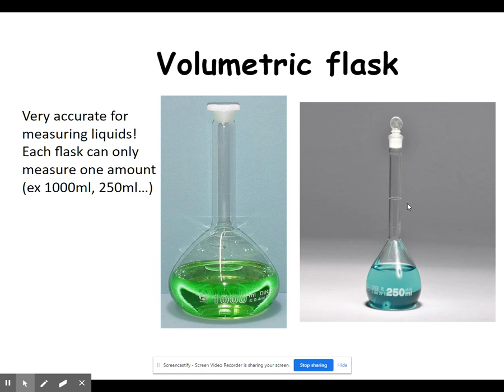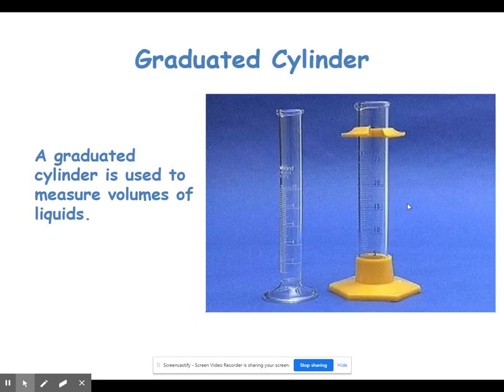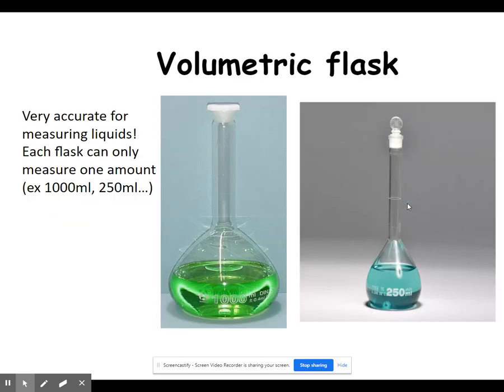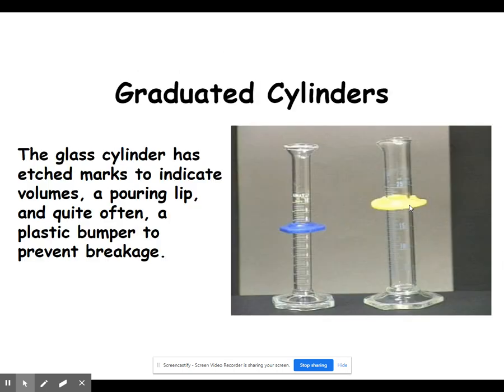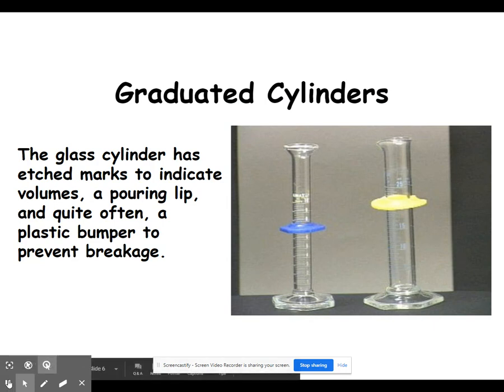If you're wanting to measure something like 27.5 milliliters, you'll need a graduated cylinder. A graduated cylinder is used to measure volumes of liquid and can measure a wide variety of volumes compared to a volumetric flask. Graduated cylinders come in many shapes and sizes — very small ones that measure a few milliliters, or ones that measure hundreds of milliliters. You'll notice markings all up and down the graduated cylinder. Many glass graduated cylinders have little plastic rings on them so that if you knock one over, the glass doesn't shatter. There's typically a small spout at the top so you can easily pour liquids from them.